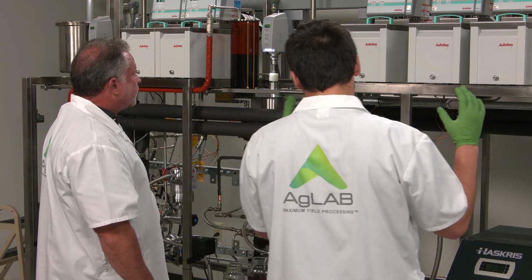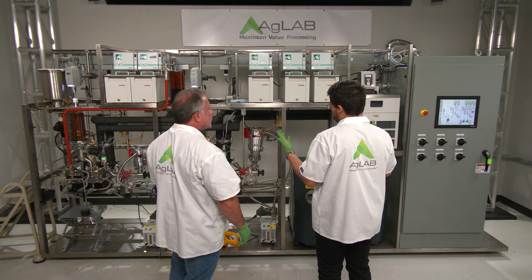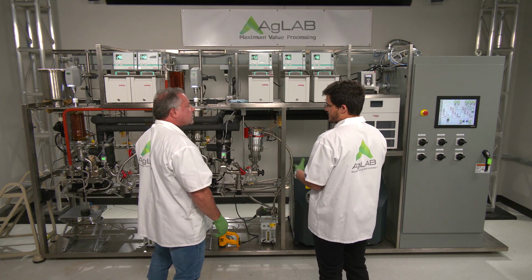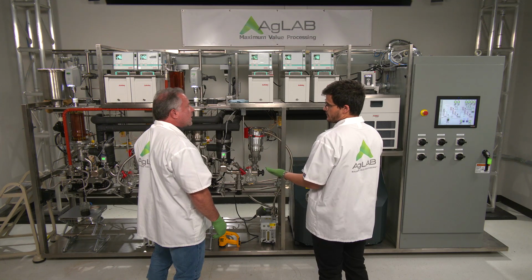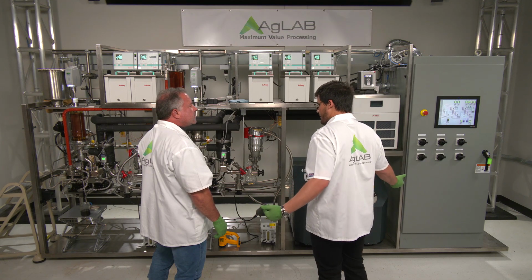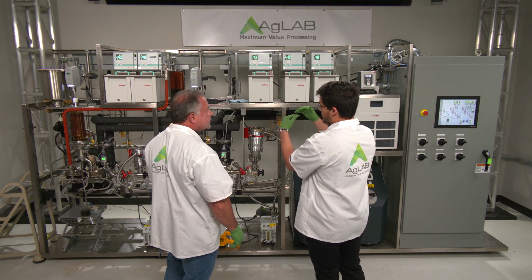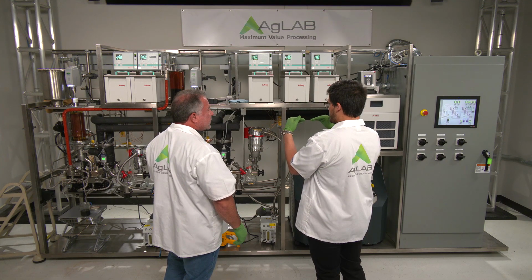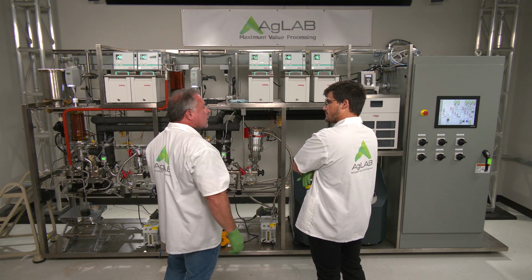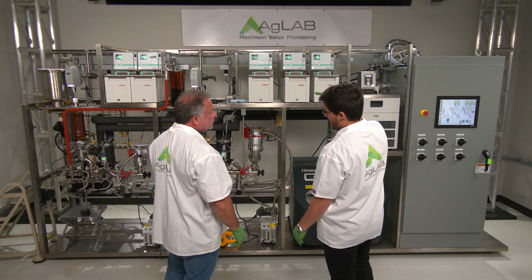So we have our evaporator. You can think of that as picking which molecules it wants to let free and give a chance to get collected as a distillate. It's selecting it through the energy that it's giving to it. Right. So it's not really picking, because you can't just select one or the other, but it's the ones that evaporate at this temperature, we're choosing those. Right. So if it evaporates at this temperature, you're selecting that one, but you're also selecting everything under that.